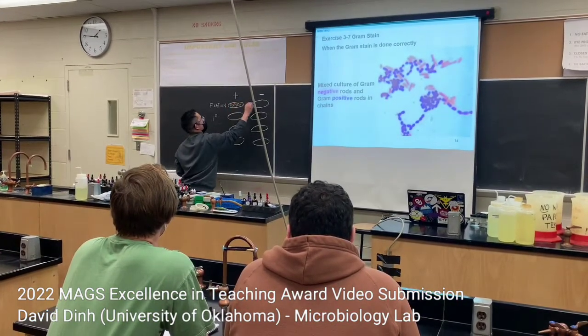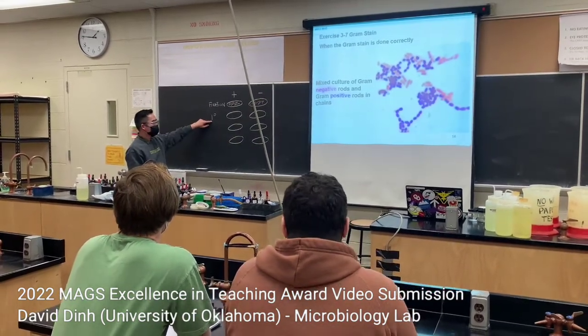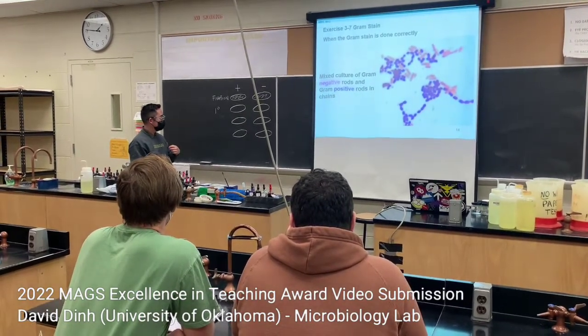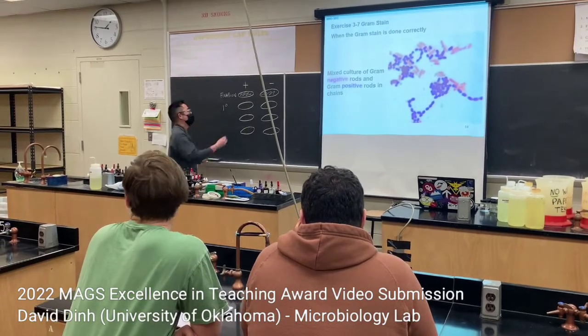That was transparent. So just note that for your exam. So after fixation, what is your primary stain? It's crystal violet. Okay. And which one will be purple? Both of them. Cool.